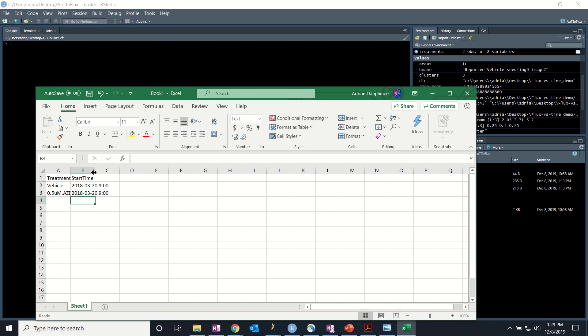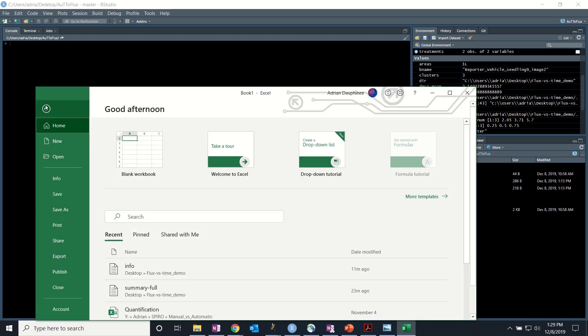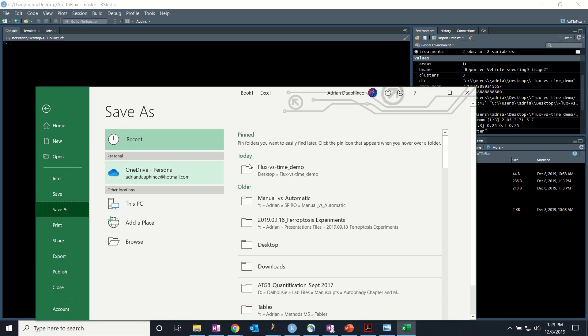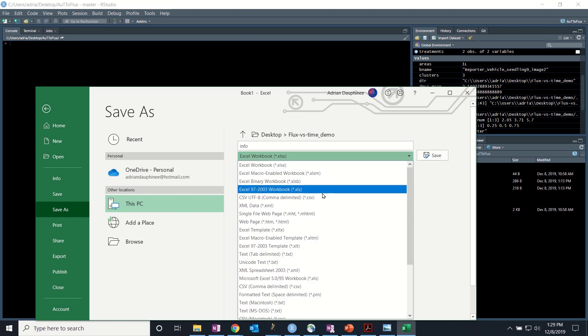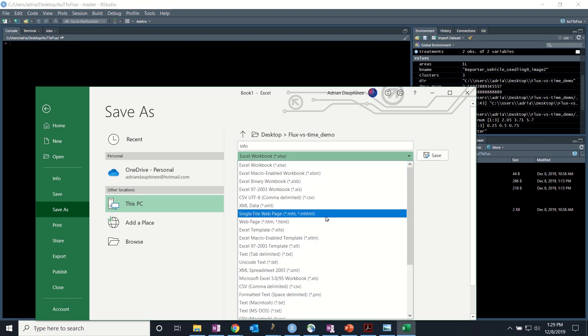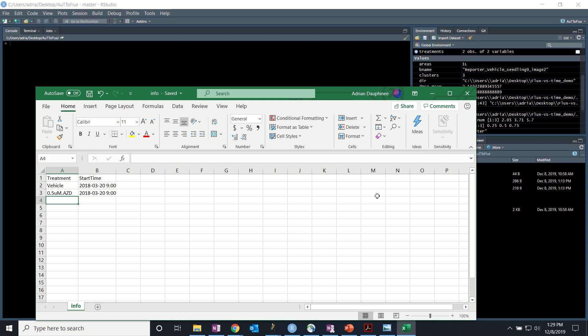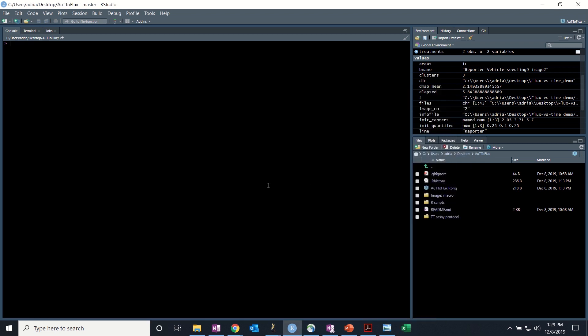Alright, so here is the example and what we need to do is just go File, Save As, select the folder and name it Info. So this file will be called Info and it has to be a tab-delimited .txt file. Click Save. And now we're ready to run the R script.